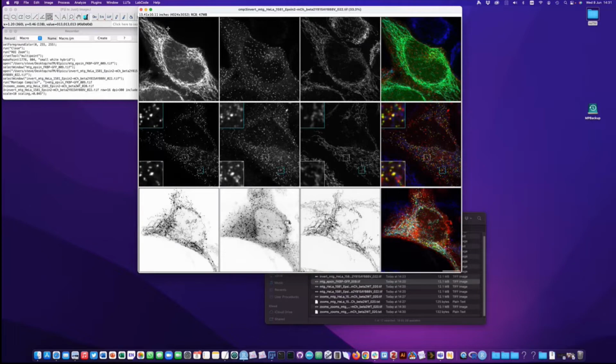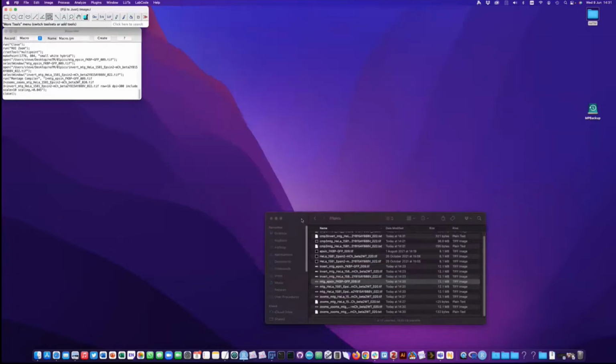Now, just another couple of minutes, promise, won't take too much longer. What I did was compile the montage there from top to bottom, and the merge was on the right hand side. Now it's possible you might not want to do things that way, so I'll just show you an example of doing it the other way around.